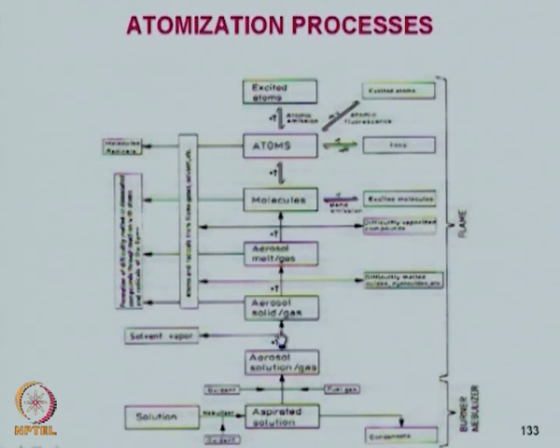then an aerosol solid-gas mixture, and an aerosol of melt and the gas, and then these should decompose to form molecules, and from the molecules a certain percentage forms the atoms, and these atoms get excited, and if they start fluorescing, again it is of no use. So, this is basically the atomization process.